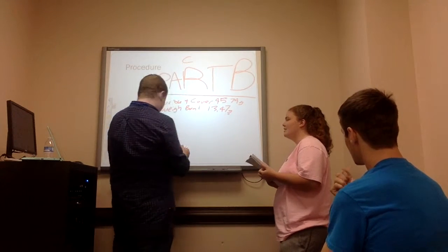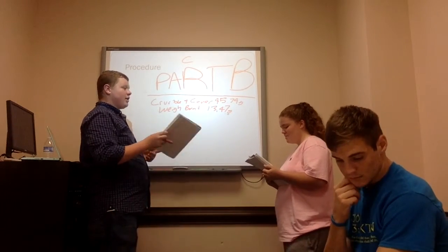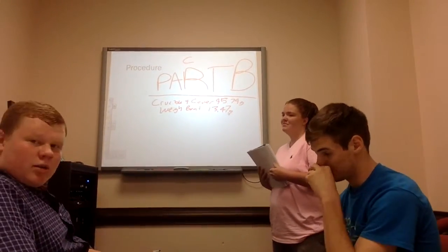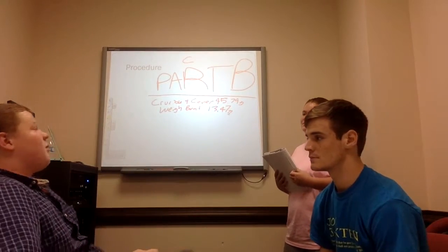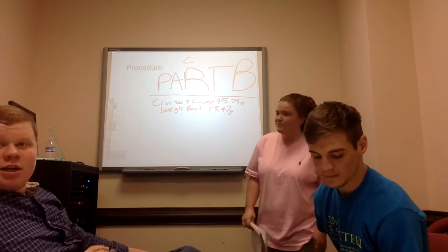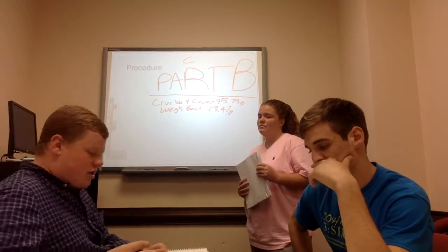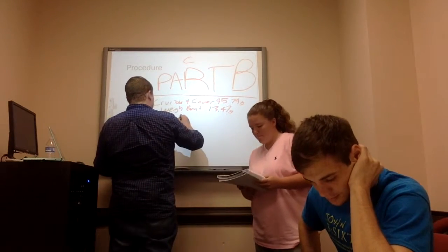Okay, but you all didn't use 4 grams of the unknown? No, you didn't. You might not remember because we did the experiment so long ago. But there was such a small amount, if you'll remember, class. Timmy, paying attention? Timmy's on board. There was such a small amount of unknown available that we decided we would use around half a gram. So you said you used 0.55 grams of unknown? Yes. Correct? Yeah.